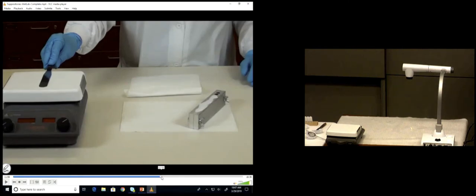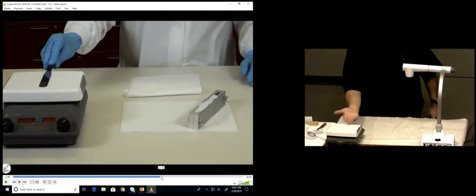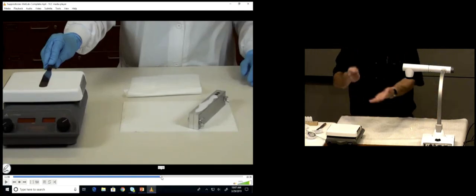Use a large metal spatula, because you want as much metal surface area as possible to be hot. And again, it's magnetic, so you can just set it on top there. After a little bit, flip it over, but have the heat on medium-high setting, okay? And I would hold it off and don't slap it on your hand, right? That's a bad idea. But hold it close. If you get your hand close, it should radiate heat.